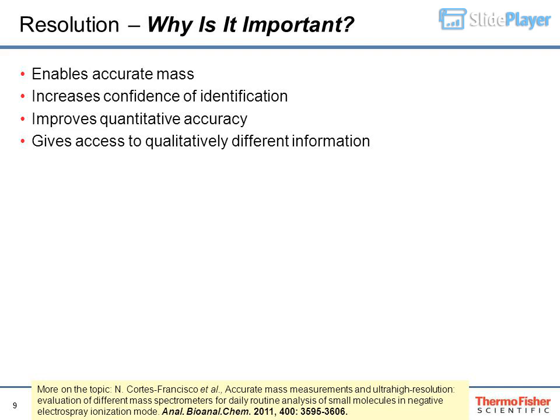At such high resolution, more than 200 species can be separated in a unit mass window. This translates into resolving, in theory, greater than 100,000 species in the mass range of 300-1000 AMU at any one point in time. This greatly reduces background interference and enables confident identification and quantitation of the target peptides in the presence of very complex backgrounds.